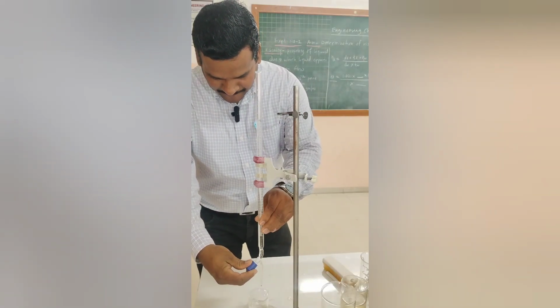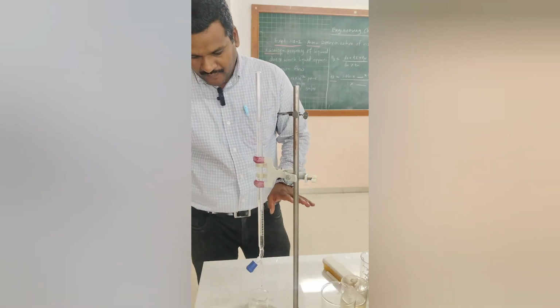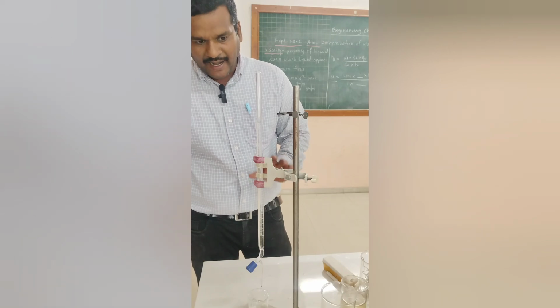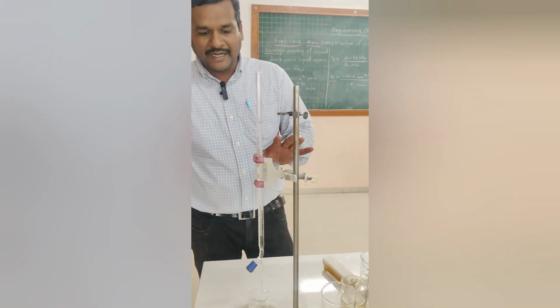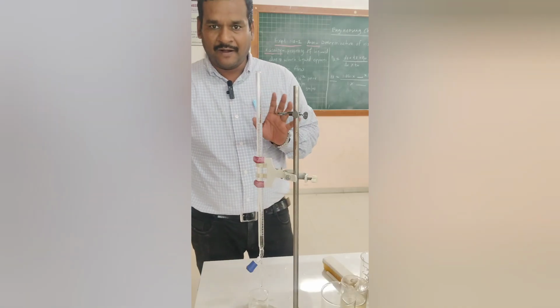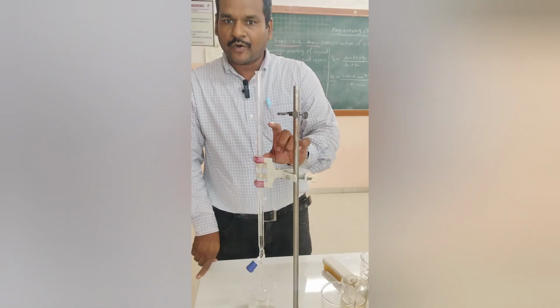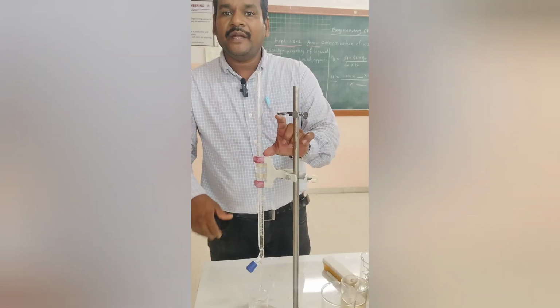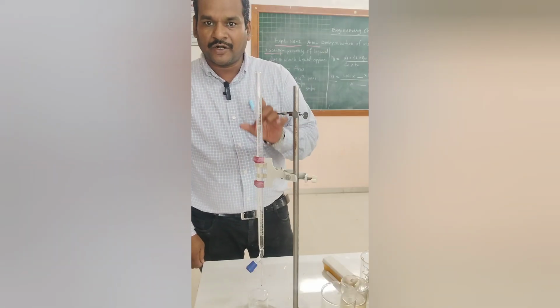Likewise, we can allow this burette to form droplets. And now what we have to do? We have to measure the number of drops that can flow from this burette in a ml. So we are going to pass a certain volume from this burette, and from that certain volume, how many droplets can be formed, that we have to measure using the water.